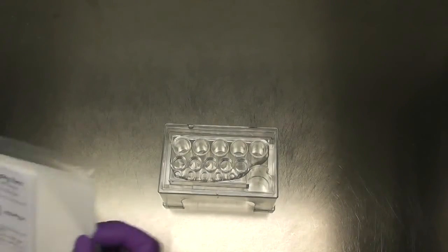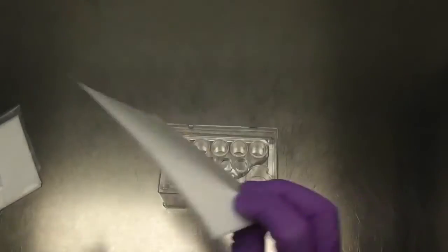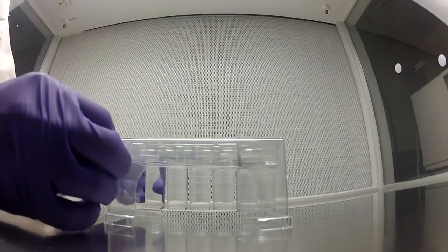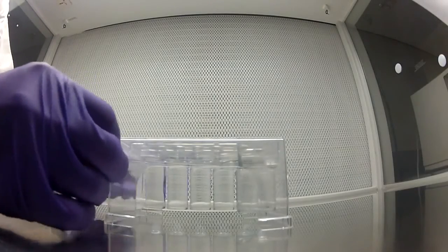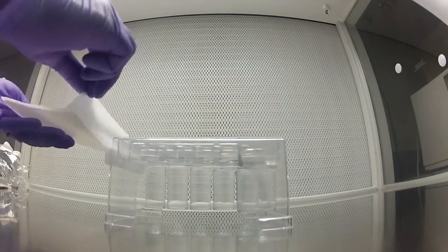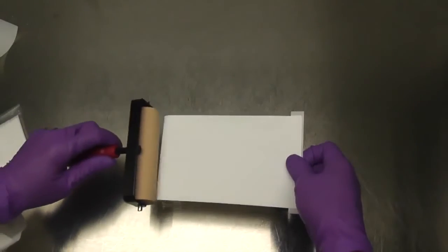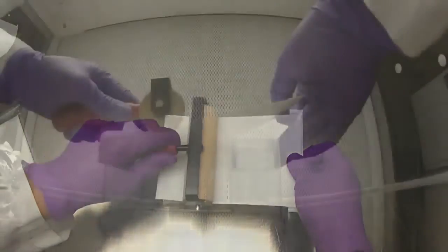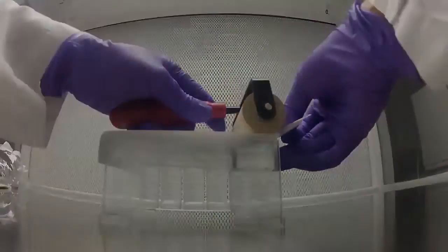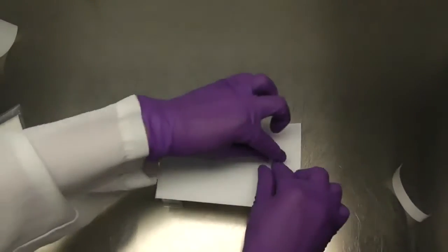Next, take a piece of the sterile sealing film and remove the first paper tab. Affix the film to the end of the plate and remove the larger paper tab. Use the roller to finish sealing the plate across the wells from one end to the other. Remove the final paper tab and finish sealing the film around the sides.